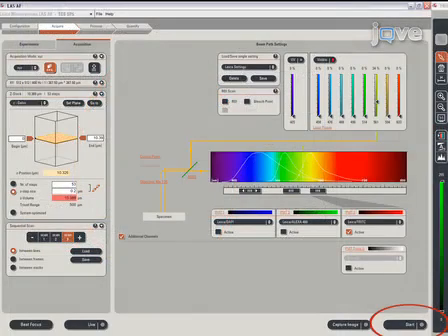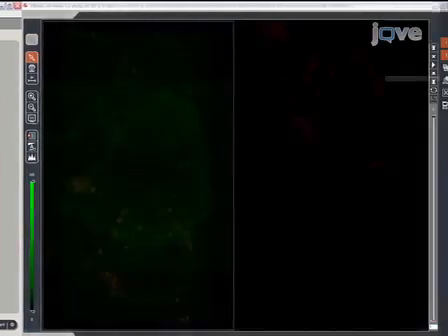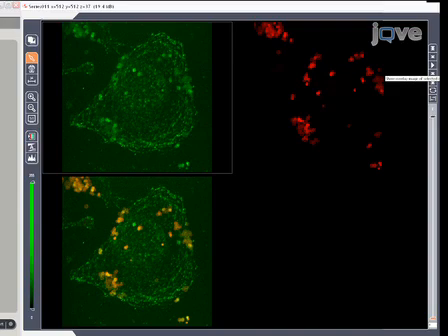By clicking Start, double or triple stained images are obtained by sequential scanning at different wavelengths, and by using the Between Lines mode for each channel to eliminate crosstalk between the different chromophores. For an indication of co-localization of two fluorochromes, select the Overlay function to merge selected channels into a single image. For example, when both Alexa 488 and TRITC fluorochromes co-localize, yellow color will appear in the overlaid image.